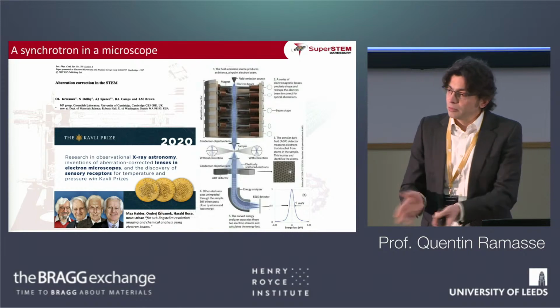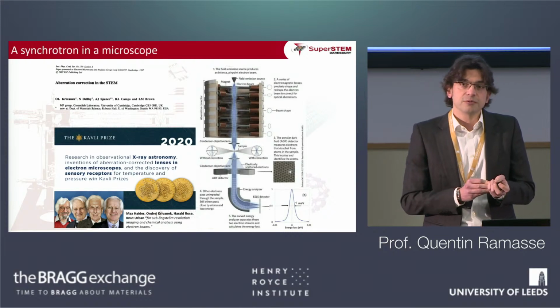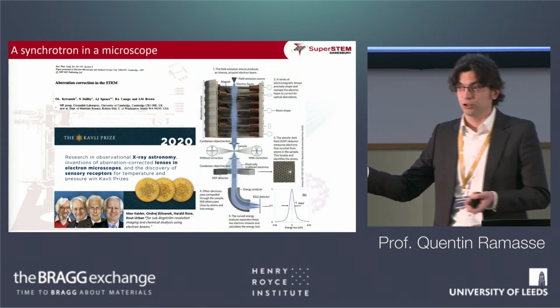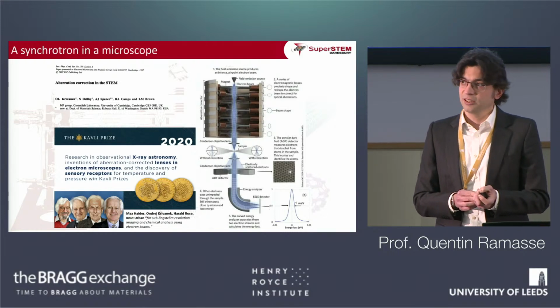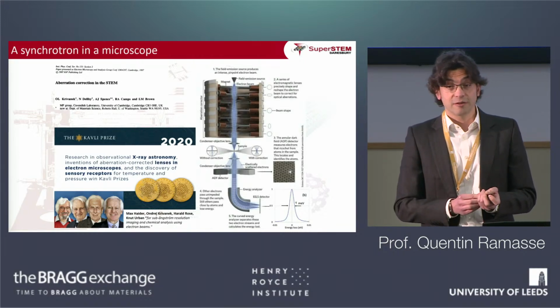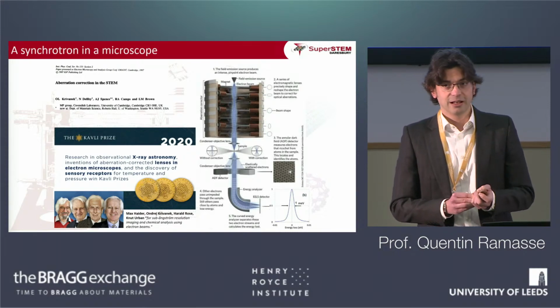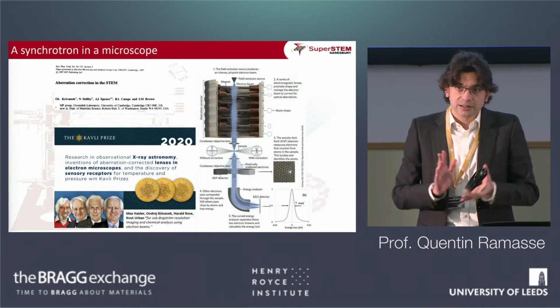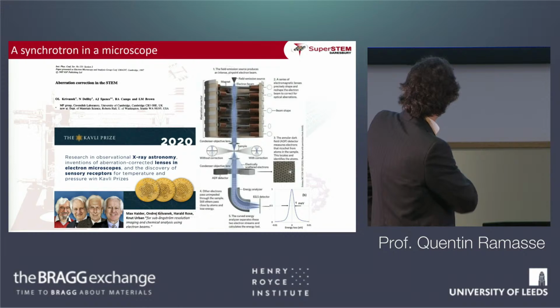Great, so we're all pretty familiar with electron microscopy, but I'll be talking about a slightly different flavor than you might be used to. The way I usually describe scanning transmission electron microscopy, STEM, is something everybody's familiar with, which is SEM. I've seen a lot of SEM images in a lot of the talks today, but put on steroids. And we're particularly lucky to have had those steroids invented for microscopy, if I can put it that way, in the late 90s, and that resulted, as I show up here, in the Kavli Prize being given to those four distinguished gentlemen on the bottom left.